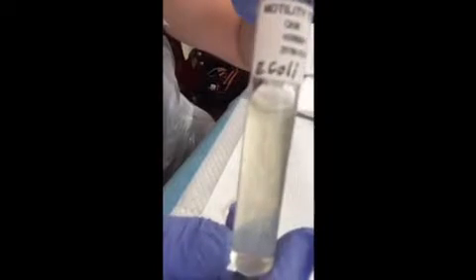So you can see the stab line here. You can see there's a significant amount of growth for the E. coli. You can kind of see the movements of the bacteria.